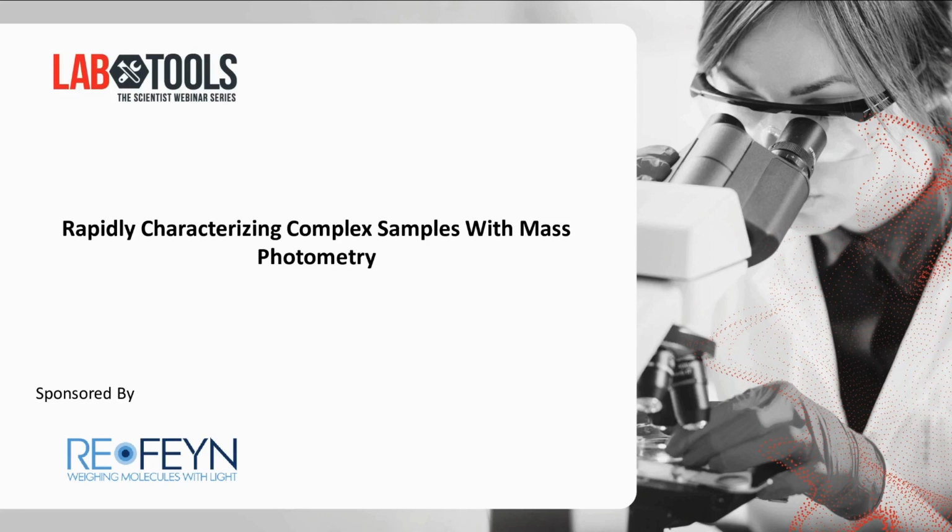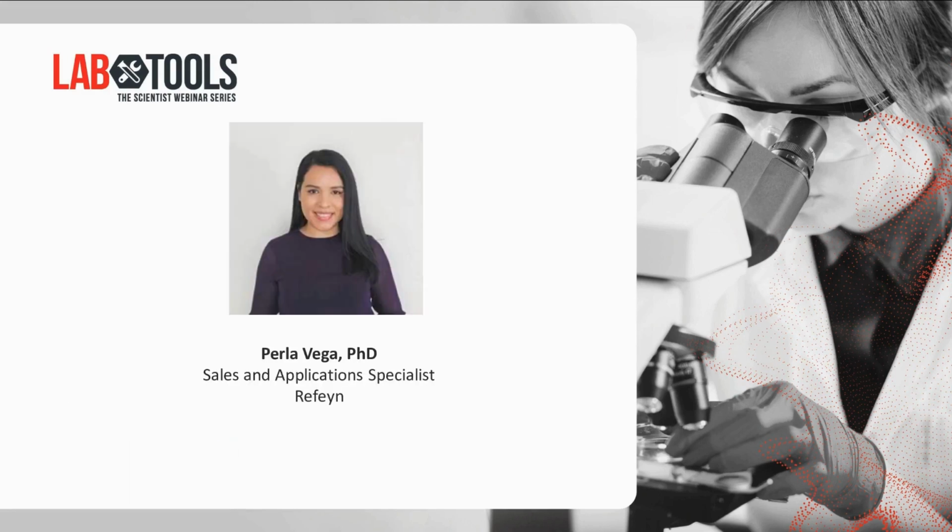Today, our speakers Perla Vega and Philip Kitchen will discuss how to use mass photometry in protein purification workflows, sample characterization prior to cryo-electron microscopy analysis, and G-protein coupled receptor solubilization. And with that, let me introduce our first speaker.